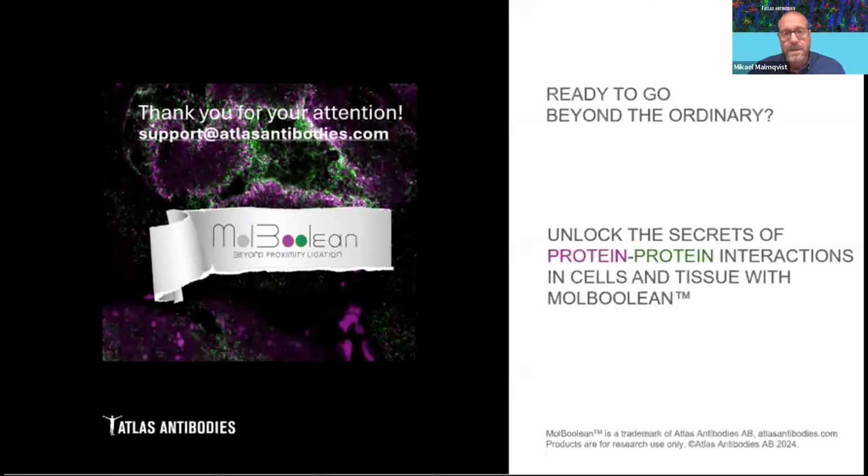All right. How does one distinguish the double-labeled interaction partners from non-interacting proteins in close proximity to each other? And I think we cannot. Yeah, the method only detects proximity. We already covered that really.